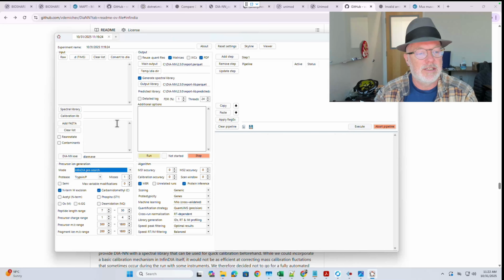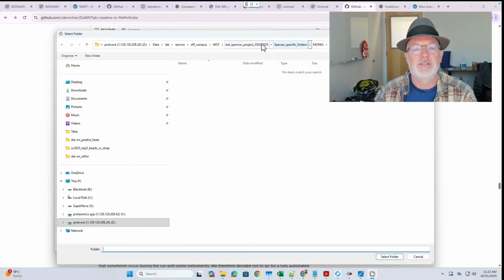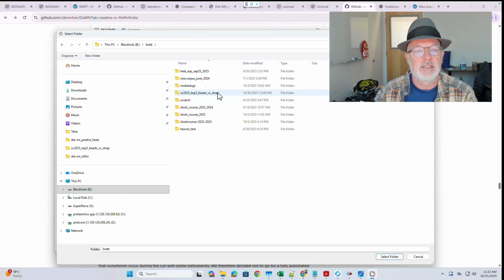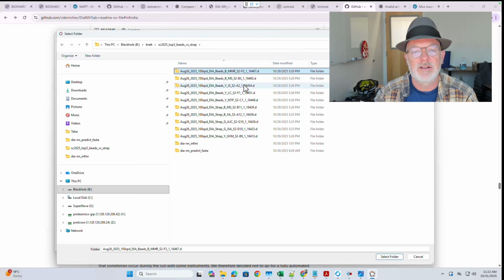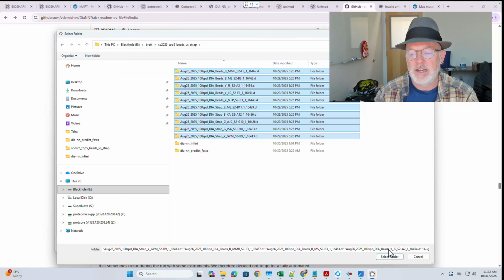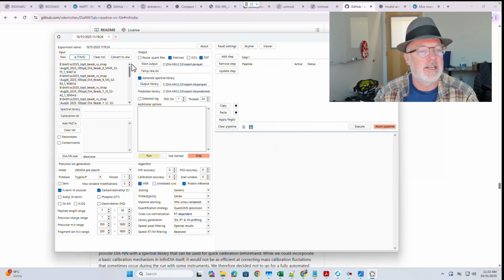And so the way we do this is we load our either raw files or our timsTOF files here in the box. You click that. Let's see, there's some data from our short course I can make available. And so you just select these, these are timsTOF files, the ones we want. I have 10 here. And so these are 10 S-Traps versus 10 SP3 digests from the short course we did this year. I just picked the top 5 from each set. And when I say top, the top number of peptides, I've already searched these, so I just picked the ones that look the best.